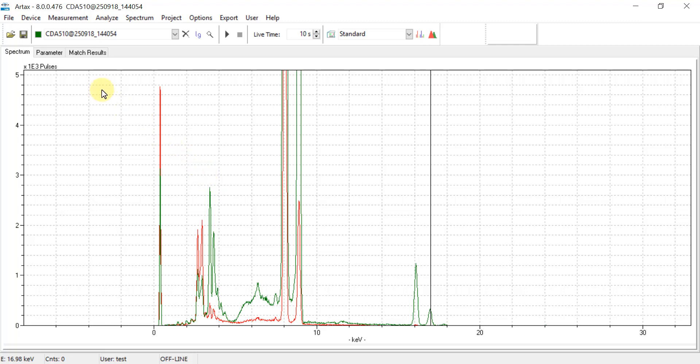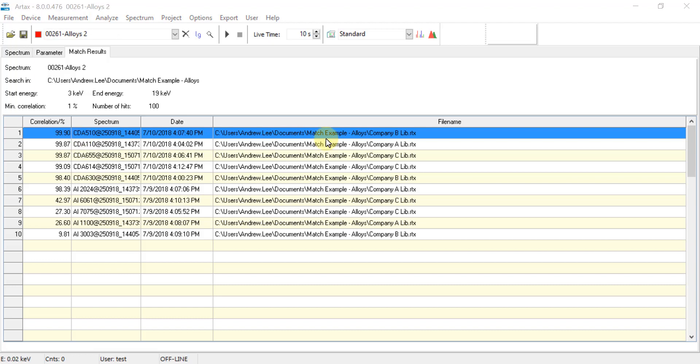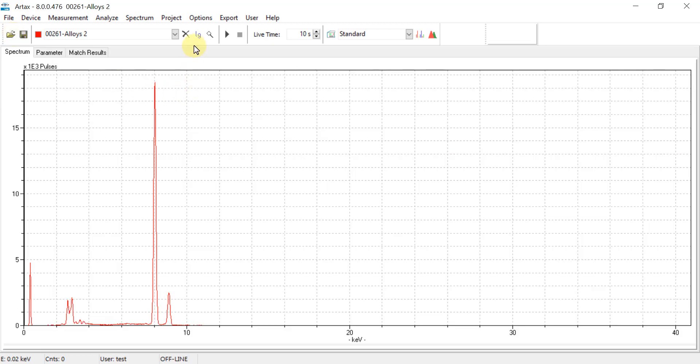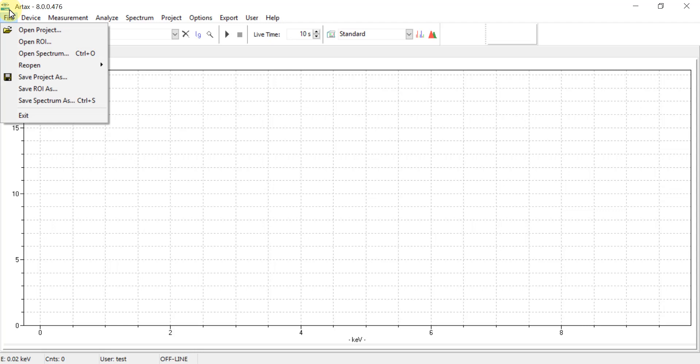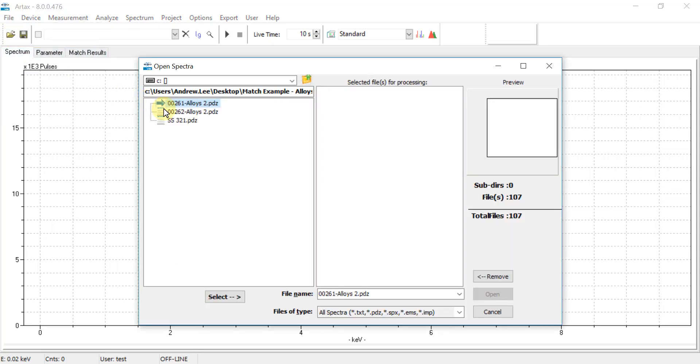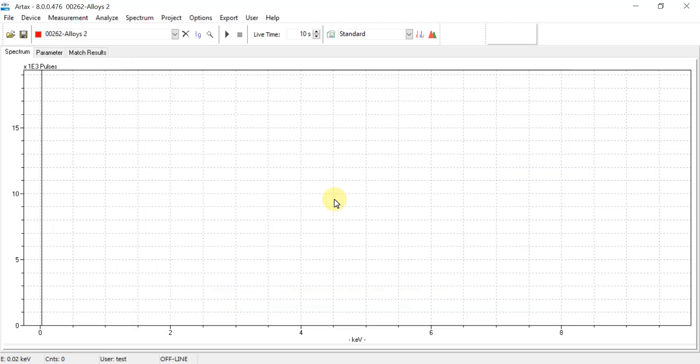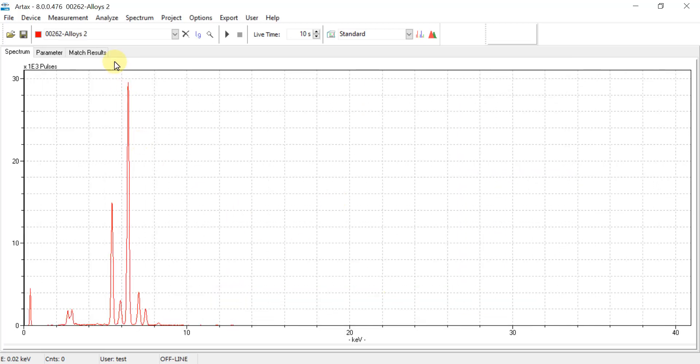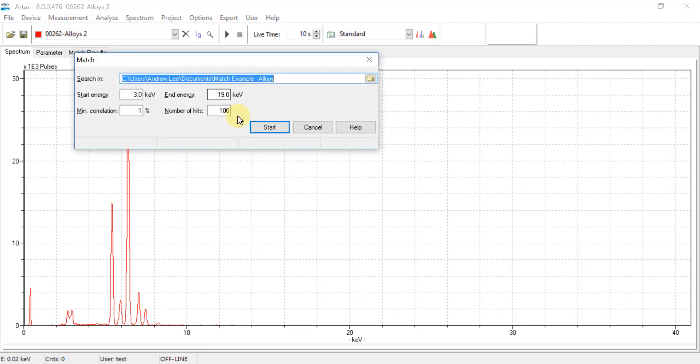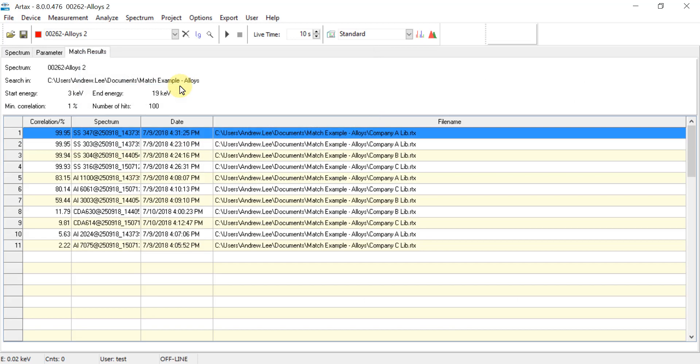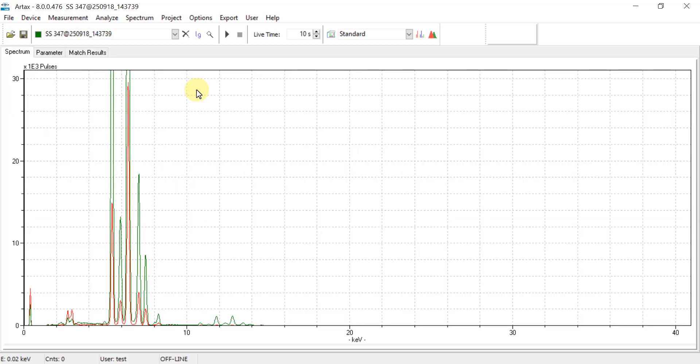To go back to the matches, simply click on the Match Results tab. To perform a new match, simply go to the spectrum tab and clear out any existing PDZ files and then open the next unknown sample. And go to Analyze and select Match, and confirm that the directory is correct, and then click Start. And our results show that the first match is for stainless steel 347 coming from company A. And then if we double click that match we can then see the overlay. In this case it would be a good idea to pick a representative peak to then normalize the two spectra.